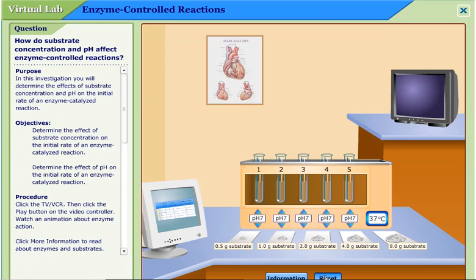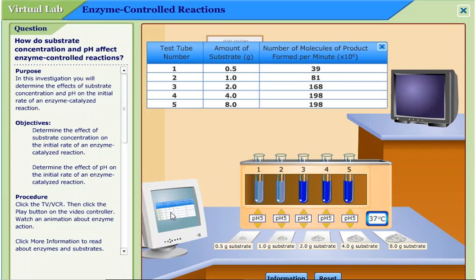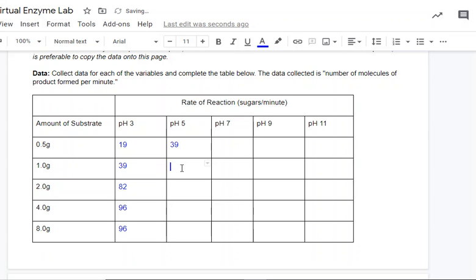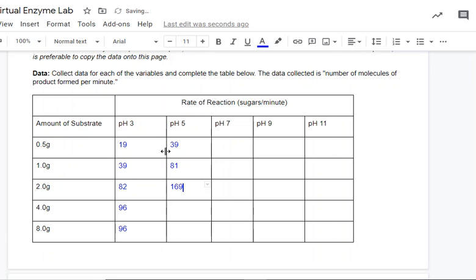Now we're going to reset. This time we're going to bump the pH up to five. Same amount of substrate in each test tube. Temperature is still 37 degrees Celsius. This time we have light blue in test tubes one and two, and we have a dark blue color change in test tubes three, four, and five. When we look at the computer monitor for our quantitative analysis, we find 39, 81, 168, 198 and 198 molecules per minute.